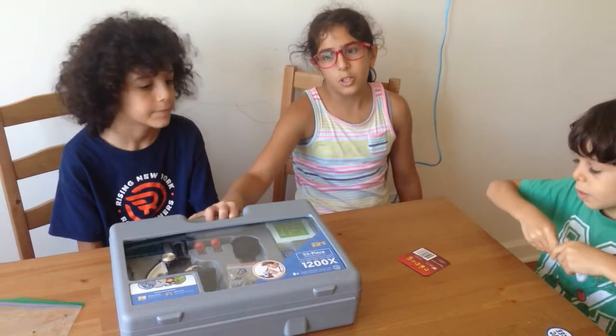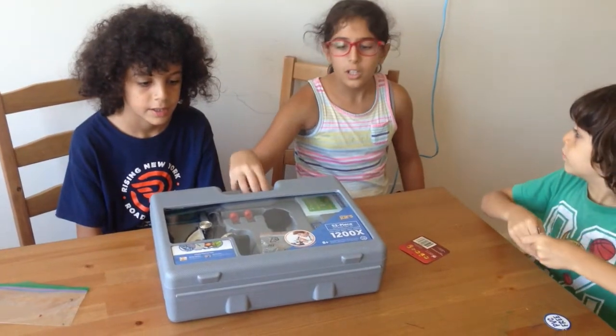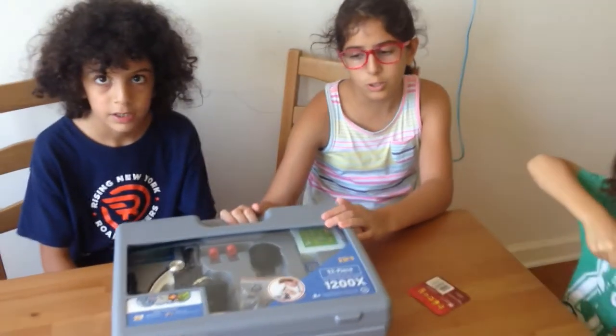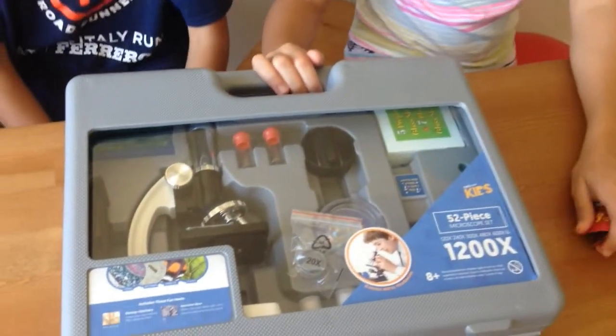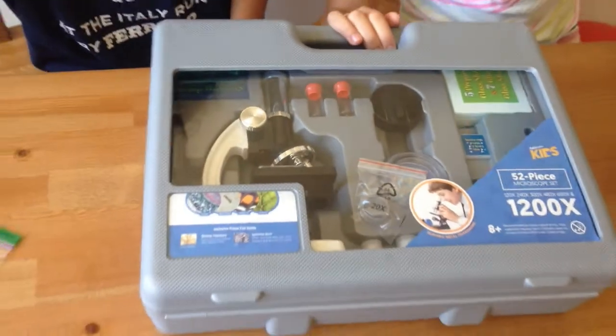Hi guys, today we're going to be showing you the microscope that Drew got for his birthday. We have tried it before, just so we could know how to do things. It was pretty cool. We tried out weird stuff, but now we're going to try out a ladybug sample.